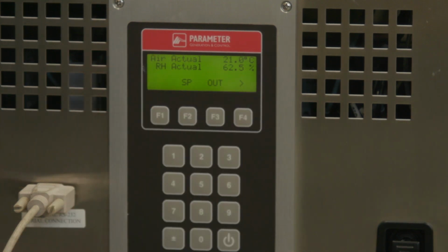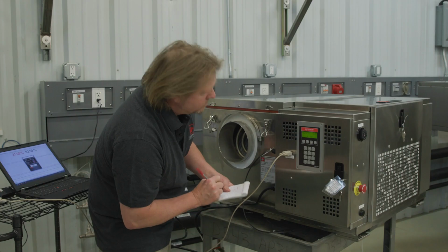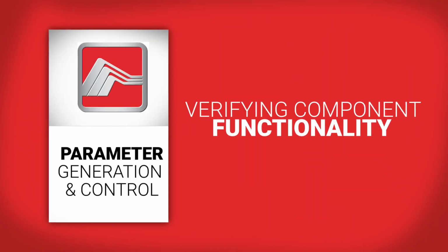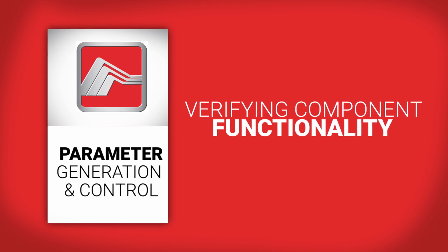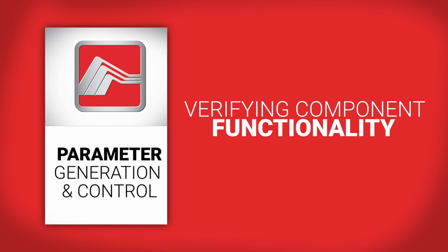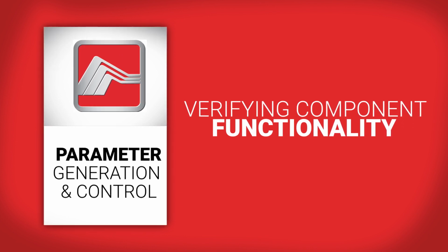Verify if the chamber controls RH. State the use of the chamber, long-term or short-term study, QC tests, or laboratory. Document the tolerance and time limit allowed out of condition, and be sure that the customer approves of the same. If the customer indicates any past or current problems with the chamber, record those notes.